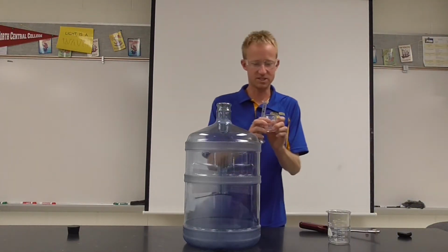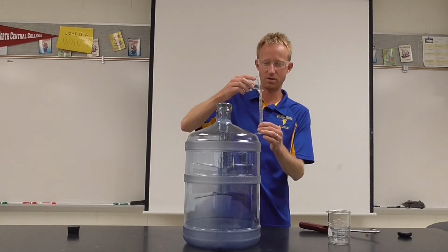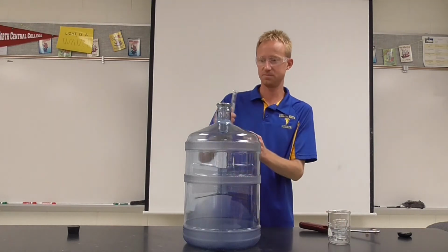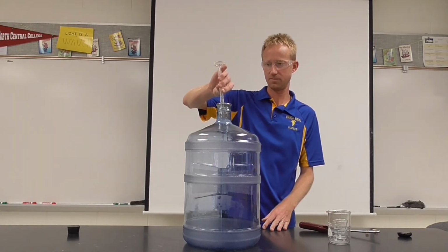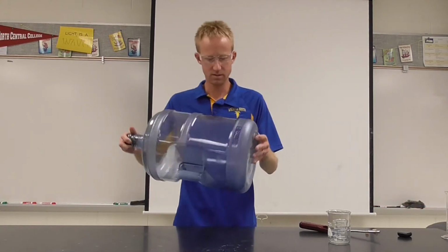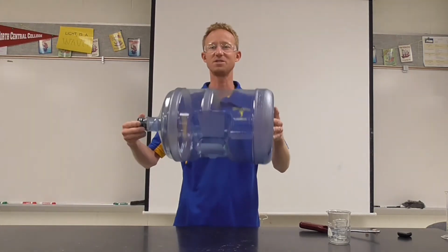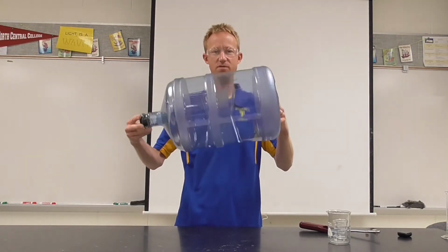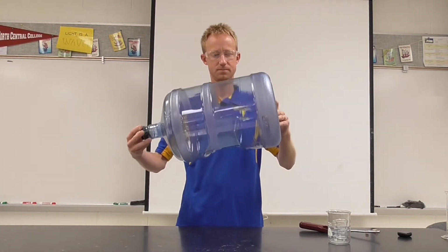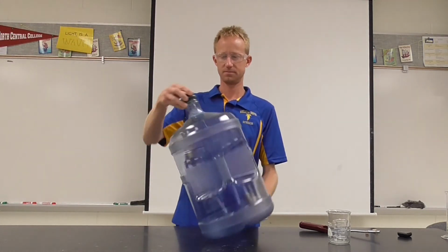So let's get again the same amount. We'll get 10 milliliters of methanol, and we'll want to vaporize it. The fastest way to vaporize it, of course, would be to increase its surface area. So this should evaporate in just a moment or two. So I'm rolling it around to increase the surface area.